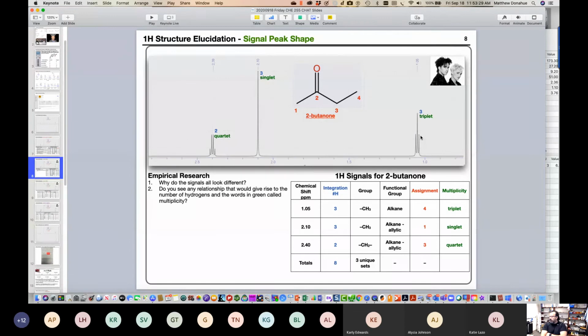So Taka and Max say it's the environment, and they're surrounded by different neighboring carbons. So yeah, their environments are all different. Can you maybe specify a little bit more? So neighboring hydrogens, yeah, that's a little more specificity. So Mac is saying they have different neighboring hydrogens.